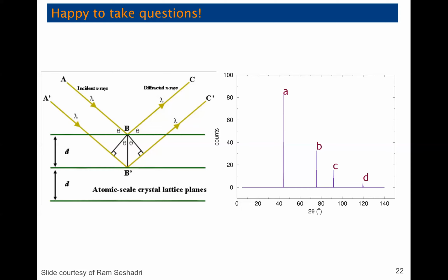If you just look at your X-ray diffraction pattern and then ask our software to look at the entire database of XRD patterns and say which one matches, it's going to give you a lot of truly strange matches if you don't give it some constraint of which elements could be in the sample.